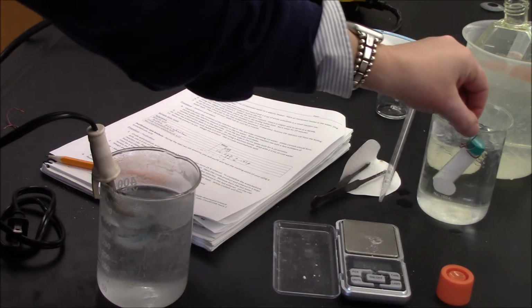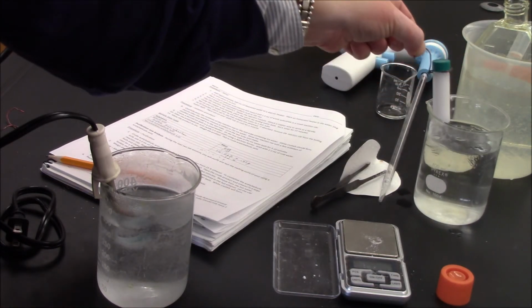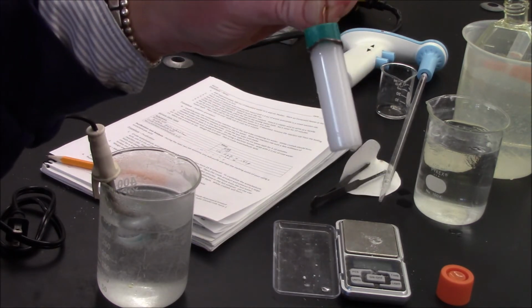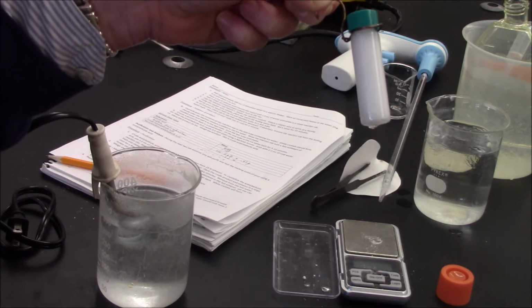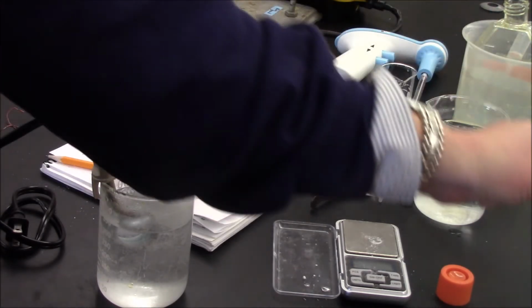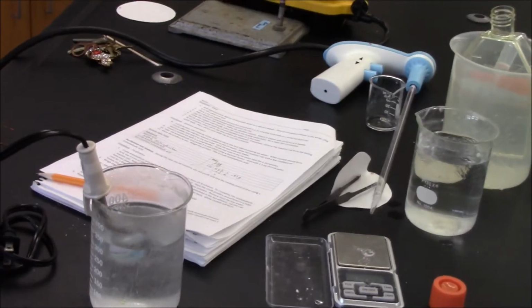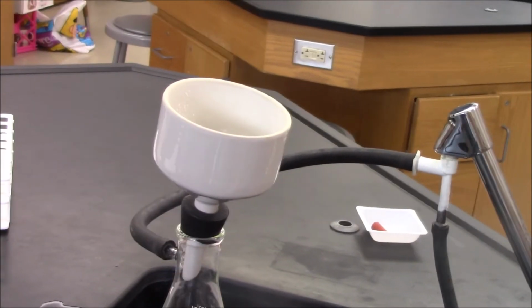So take a peek. Look at this. Pretty awesome, right? Now the challenge is going to be for me to get this out of my reaction vial and into my funnel. So here, we're going to be doing this again.